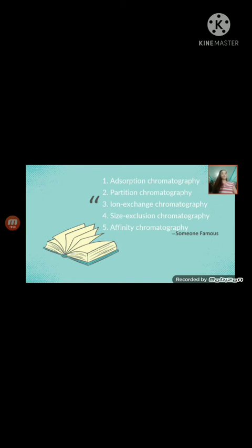Examples of this are methanol, isopropanol and acetonitrile. The stationary matrix is prepared by attaching long chain alkyl groups, for example octadecyl, to the surface of irregular or spherical shaped 5 micrometer diameter silica particles.